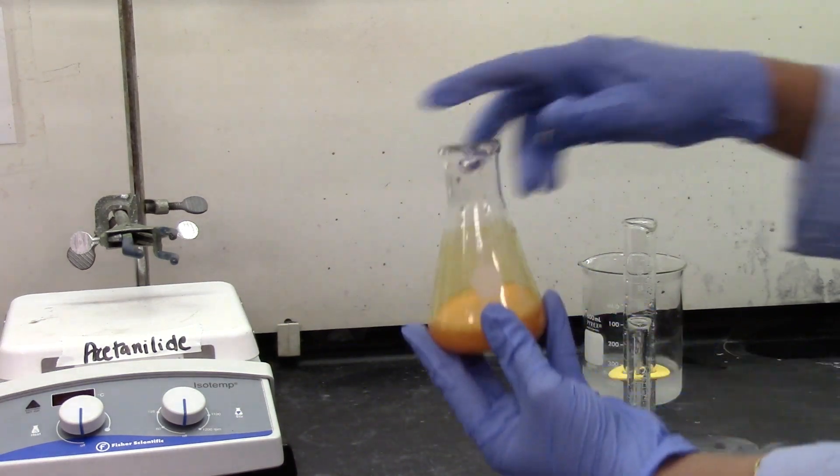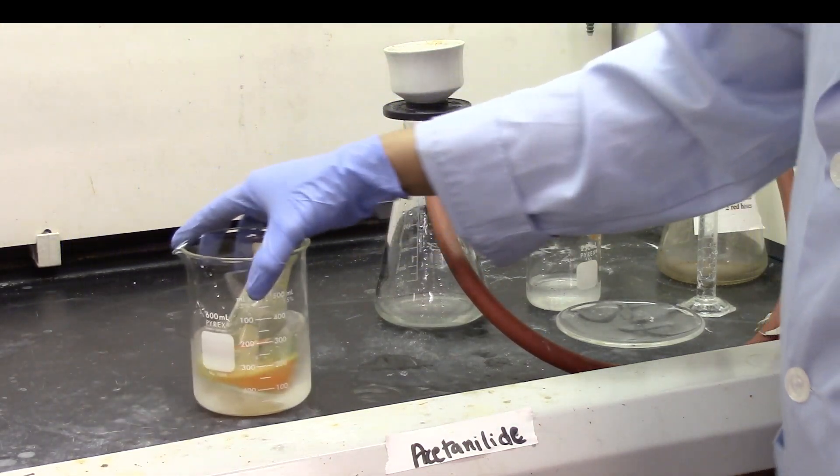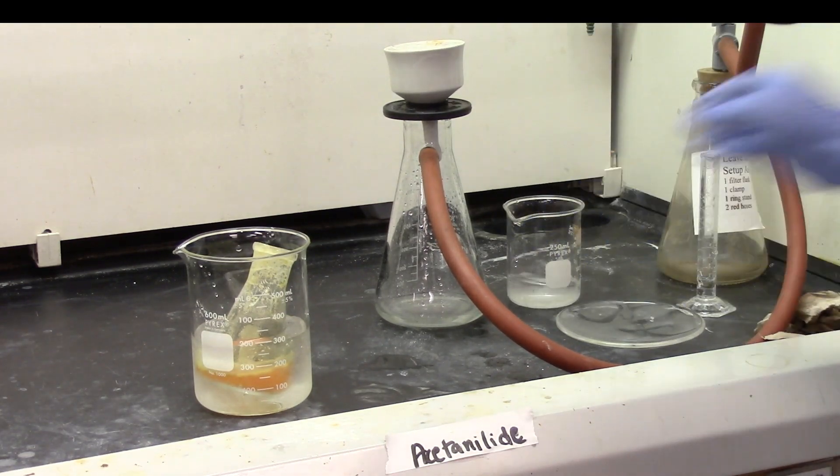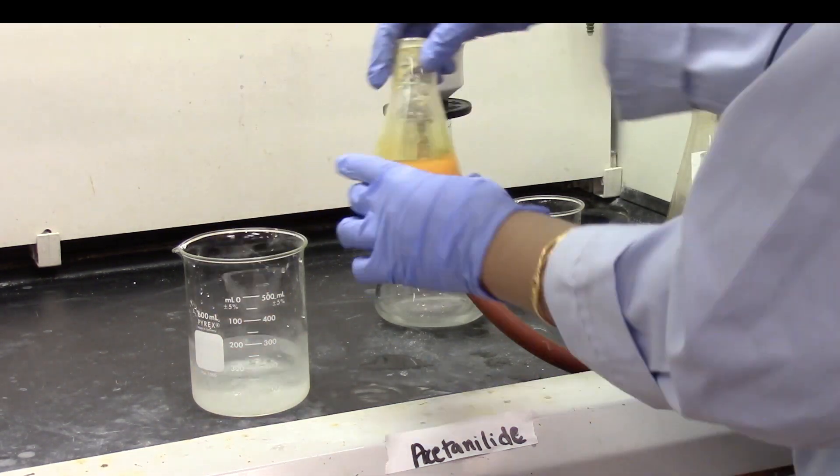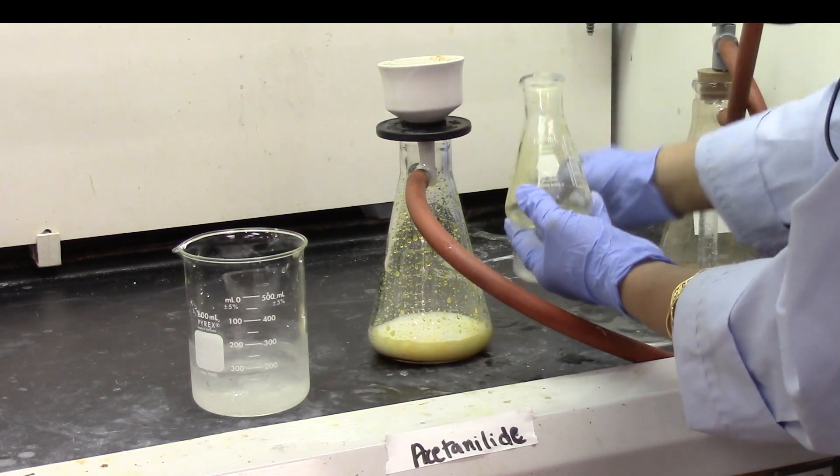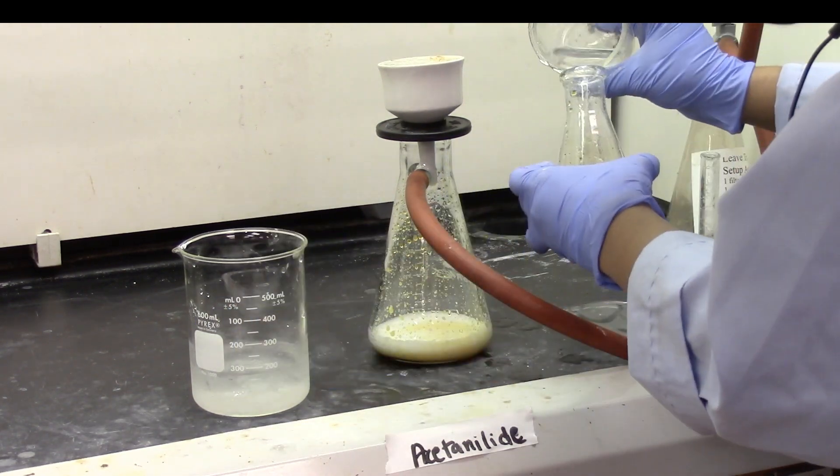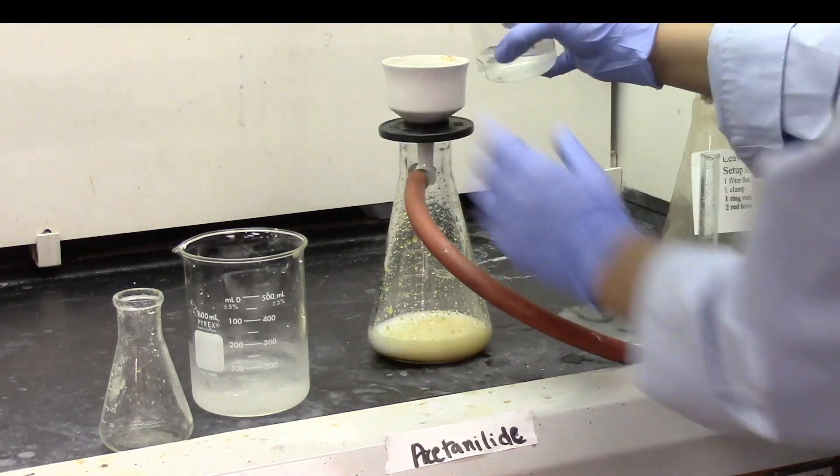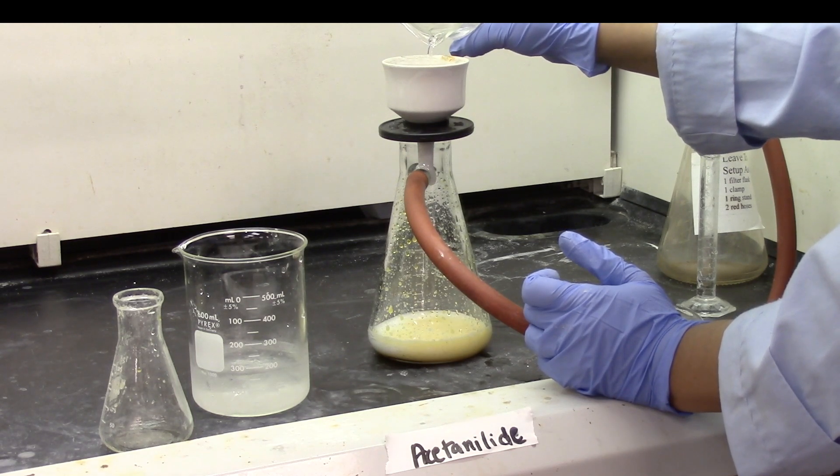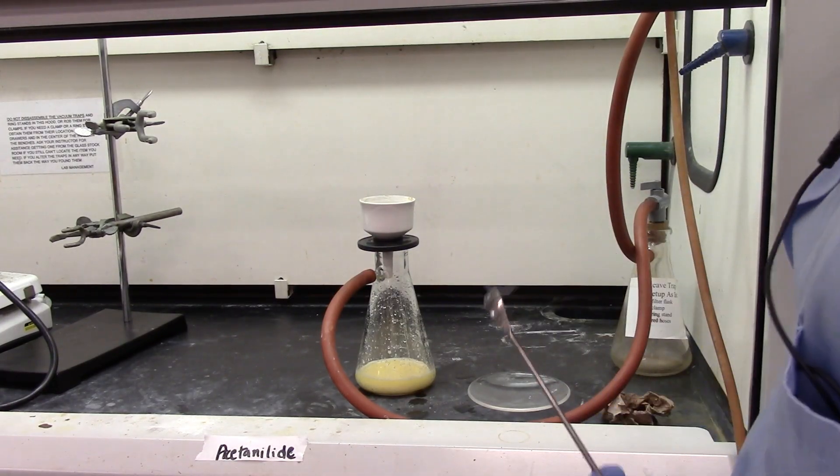So now I'm going to let it cool down in some ice cold water. I will go ahead and filter out the acetanilide product. I put the filter paper in the flask, wet the filter paper with some DI water, then turn on the vacuum. And wash the Erlenmeyer flask with some cold DI water which goes on the filtering funnel.